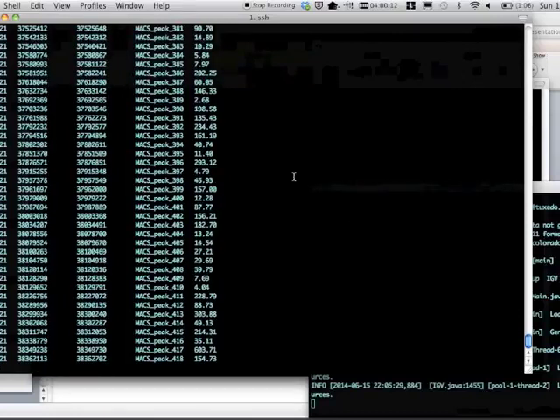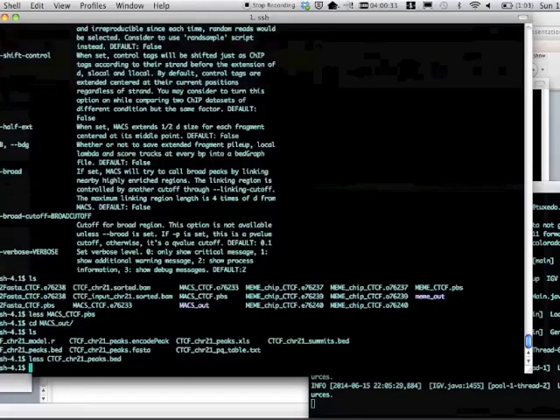One thing you could do if you were savvy and learned how to write a couple of quick scripts, which I highly encourage that you do, you could use something like Python or Perl to parse this file for only scores above something, say scores above 200, and then go look particularly at those scores.